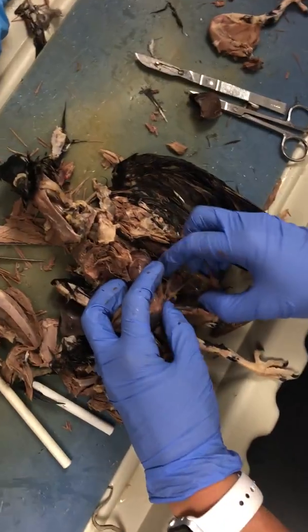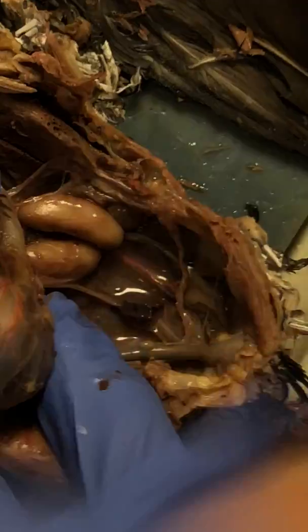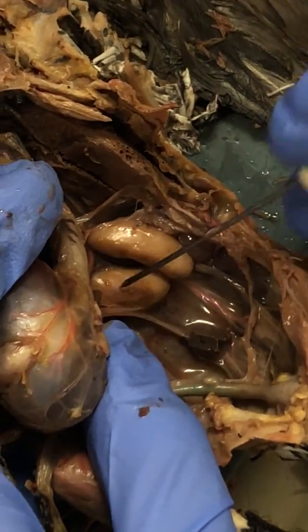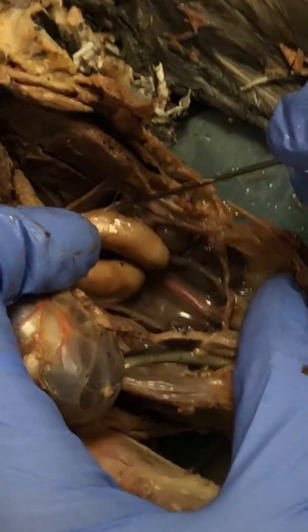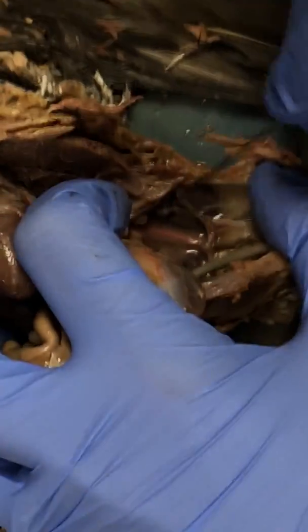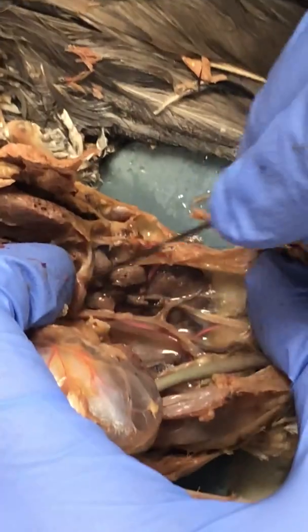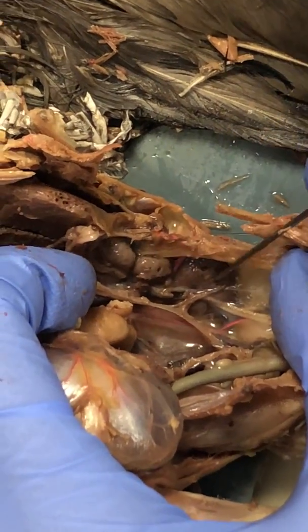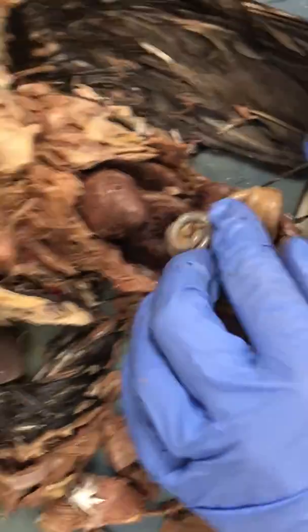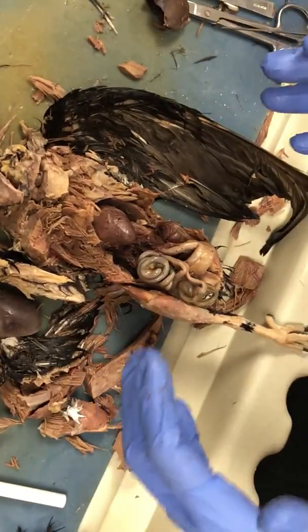If we move this to the side and look further in, we can see that this is a male because of these two large structures right here — these are the testes. Underneath those structures, we've got these round structures, and they come up the body — one, two, three — right here you can see these are the kidneys. They don't have a sphincter, so whenever they defecate there's nothing to hold it in and it just happens all the time.